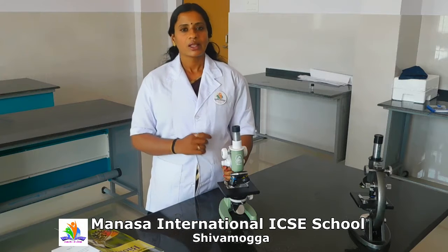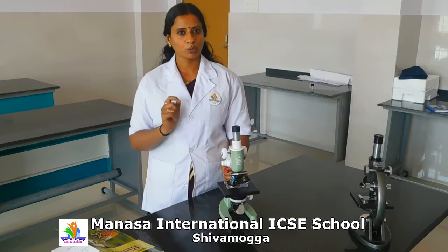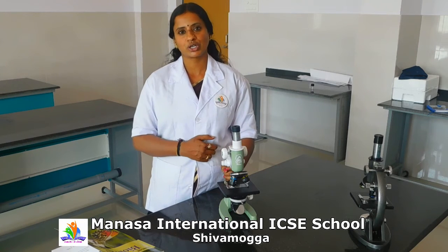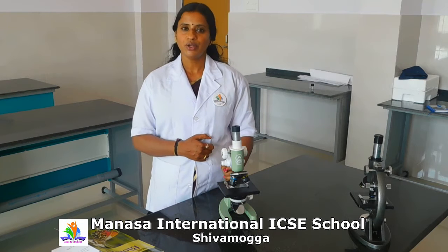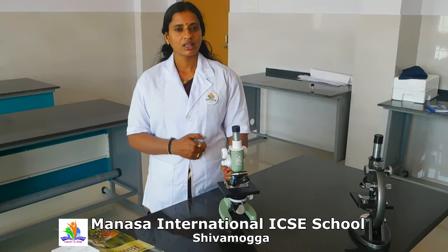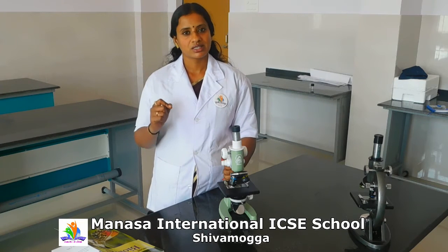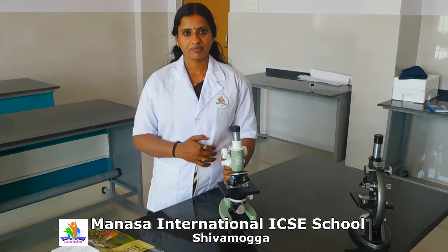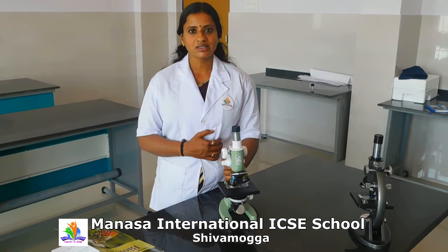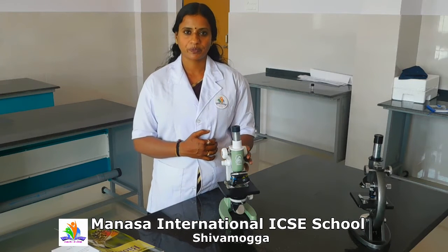So Robert Hooke. Then he came to know that there is a cell, and inside that there is a protoplasm. Protoplasm is a living substance which consists of cytoplasm and nucleus. And what is cytology? The branch of biology which deals with the study of cells. Clear? In today's biology practical class, let us know about the compound microscope.